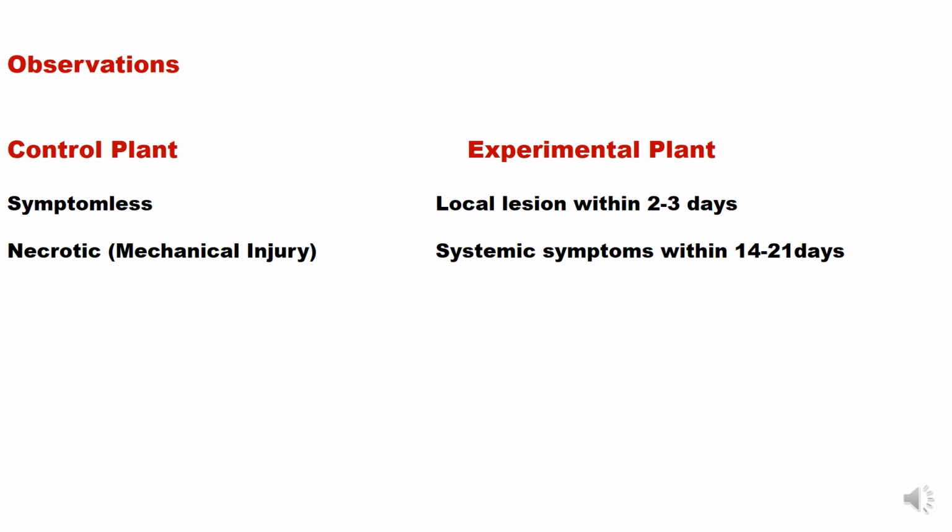This is a very simple explanation of the mechanical transmission of plant viruses, and this process is usually adopted by plant virologists all over the world in order to check the presence of virus in the infected tissue, as well as for many other purposes, such as checking the host range of plant viruses, as well as checking plant resistance against plant viruses.